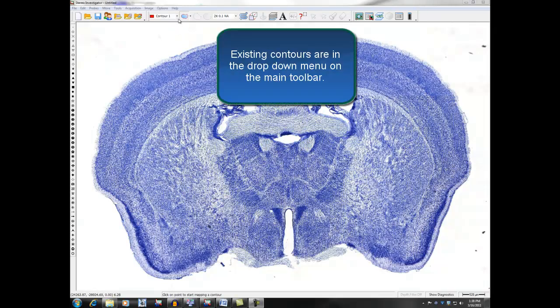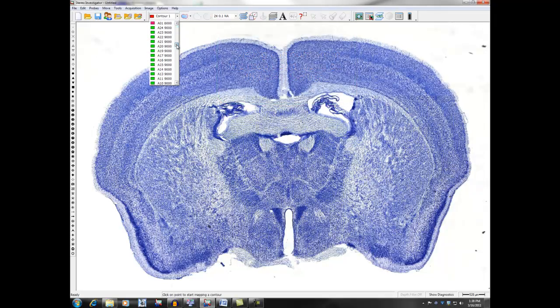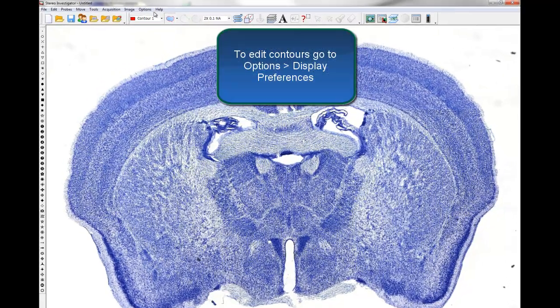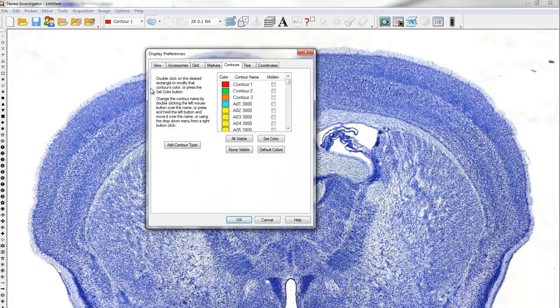Existing contours are displayed in the drop-down menu in the main toolbar. To edit the contours, go to Option Display Preferences.